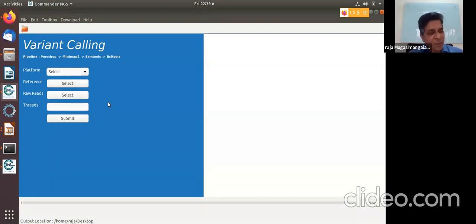See, one of the things Anand came and told me, when we were getting MGI data, just for showing you, I have never analyzed MGI data, by the way. MGI SARS-CoV-2 data, they sent me today. So I changed the file location to MGI, that location. Sometimes in Linux, those things happen, so you have to be careful here. The output location, you have to keep it only where you have permission. I had given a location from a server, so this won't allow me to write there. That's why it was crashing.